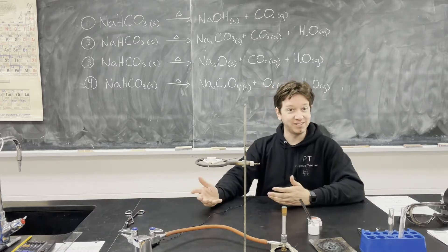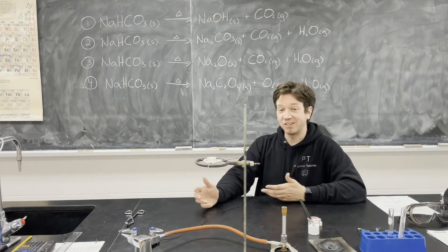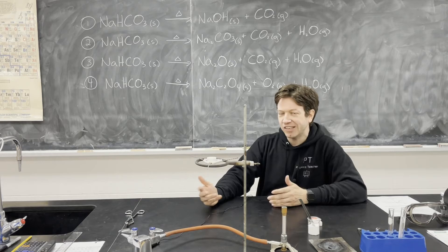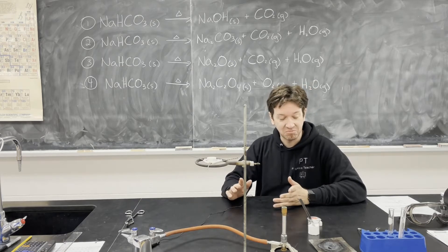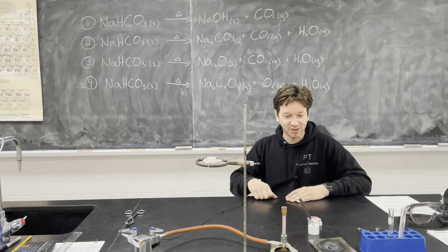Now the gas test I'm going to do is I'm going to use lime water. Now if carbon dioxide mixes with lime water we get a precipitate. So here's what we're going to do.